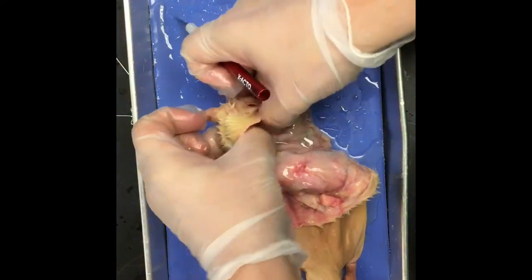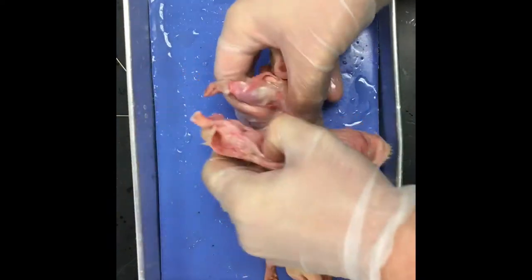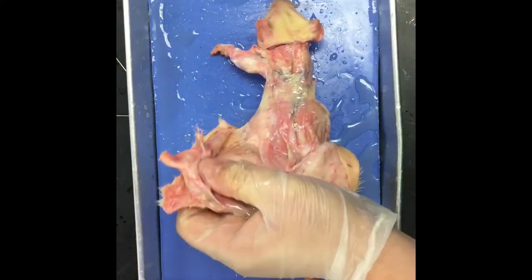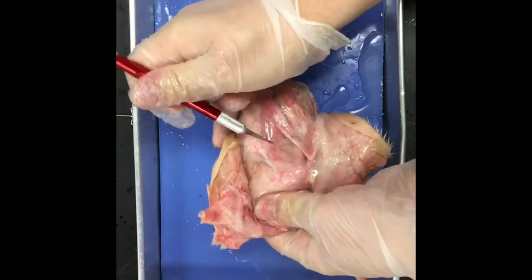All right, so you're breaking the rat's bone. Degloving step two. Thumb through. Don't break its ribs. Boop. Oh, just ripped its arm off. Once you apply a little bit of pressure here, it comes through, and you're just going to cut that connective tissue away.